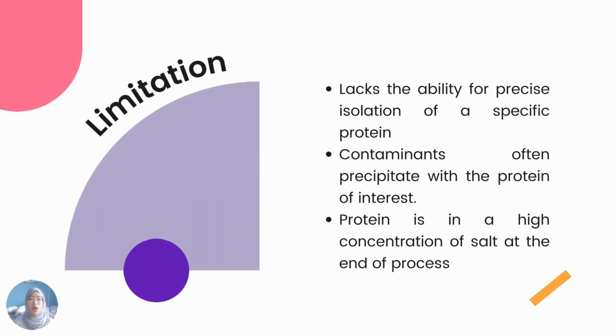However, it does come with the limitation that it lacks the ability for precise isolation of a specific protein, which means that it cannot be a standalone method. Contaminants often precipitate with the protein of interest, and the protein at the end of the process will be in a high concentration of salt.